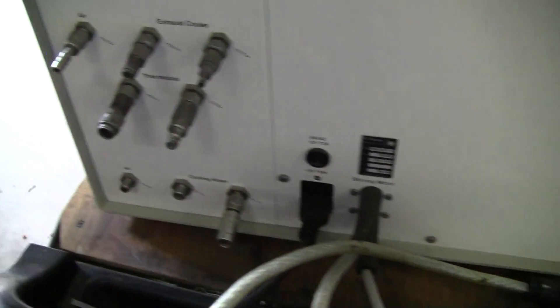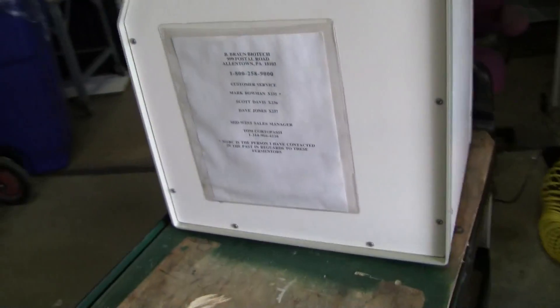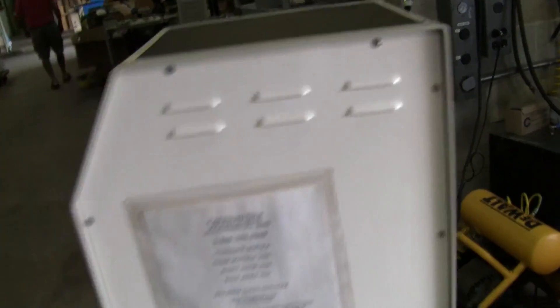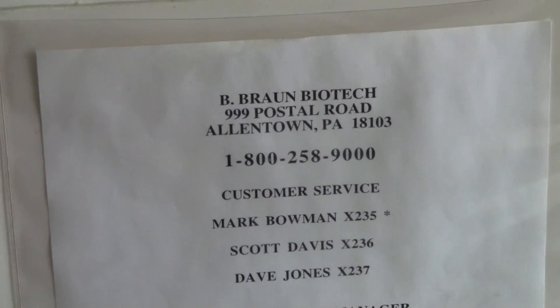Control head. Rear of the unit. Quick numbers for that.